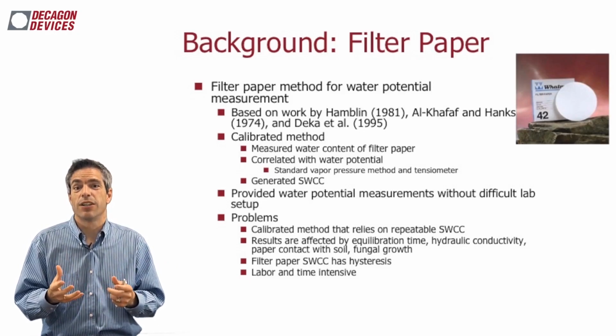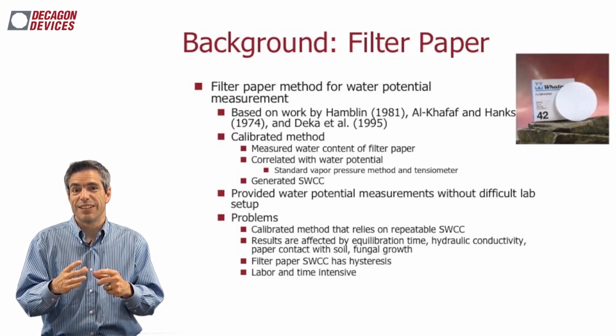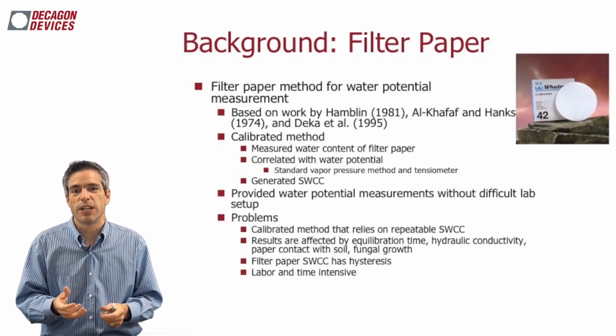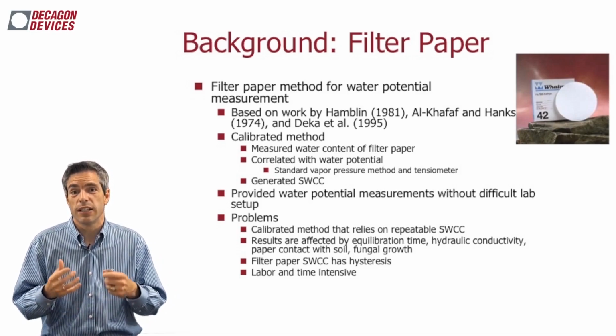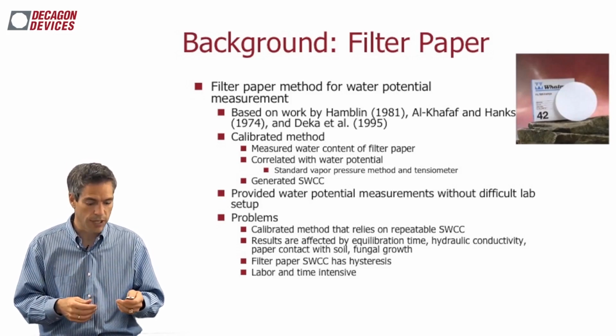Other things that cause problems. After a while, you get fungal growth on the filter paper, which is a bit of a problem. You can see that there are many challenges. Now it goes on being used. It's a technique you can get water potential from, but in my opinion, there are better techniques, and we'll talk about that.